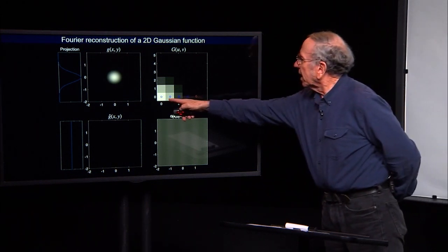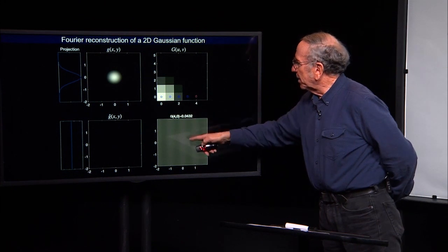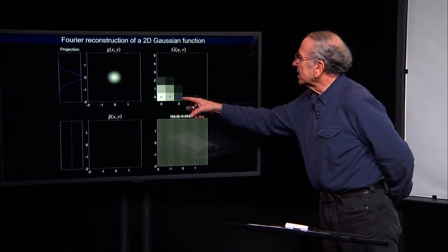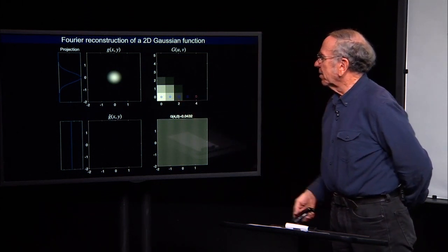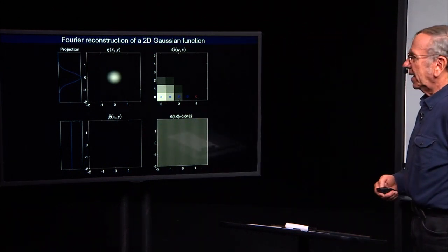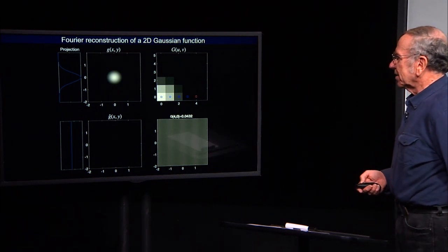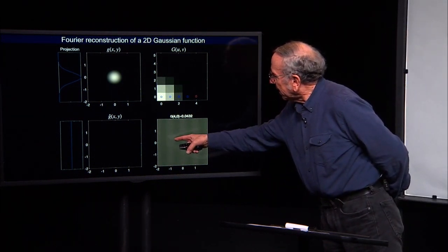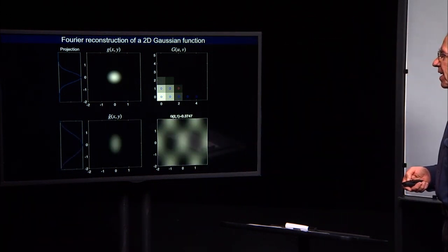As I plot these points, what I'm doing is taking a component, in this case with 2 cycles per the entire width, scaling it by an amount that is indicated by the gray level there, and adding it into my final function. There's not a lot to be seen, but here you can see I have a cosine with 4 cycles running across.